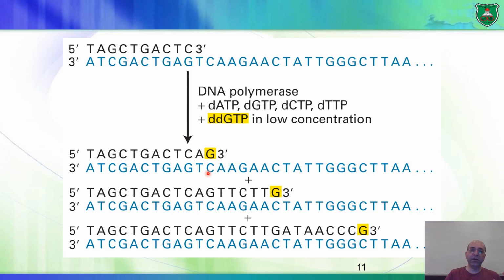So we have 900 molecules having the normal G, and as a result, the DNA polymerase can continue the synthesis of DNA. But for 100 of them, since it adds dideoxy G to these 100, synthesis is terminated, right? So we're going to have a very short DNA fragment right here. So let's say for the other 900, DNA synthesis continues.